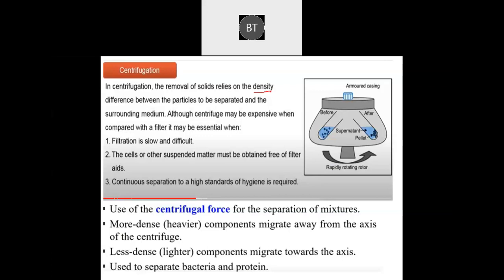Unlike centrifugation that is conventionally carried out at laboratory scale, there are certain limitations for large scale industrial centrifugation. In the laboratory we use small centrifuges, which are obviously not useful for the large industrial scale. But nowadays continuous flow industrial centrifuges have been developed, with continuous feeding of slurry and collection of the clarified fluid, while the solid deposited can be removed intermittently.